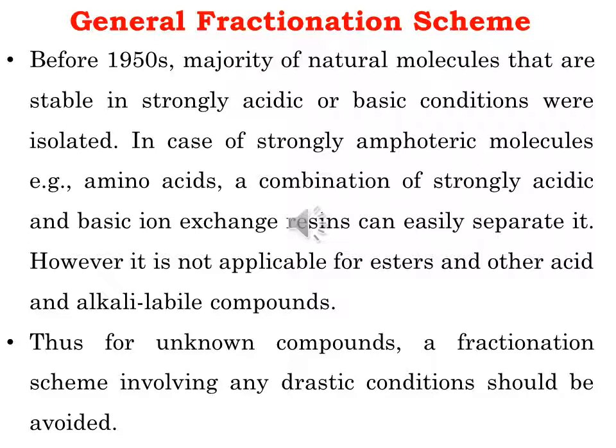The procedure, however, is not applicable for esters and other acid or alkali-labile compounds that do not survive the extreme pH conditions of the reagents and buffers. Epimerization of chiral centers can also be a problem. Thus, for an unknown compound, any fractionation scheme involving drastic conditions should be avoided.